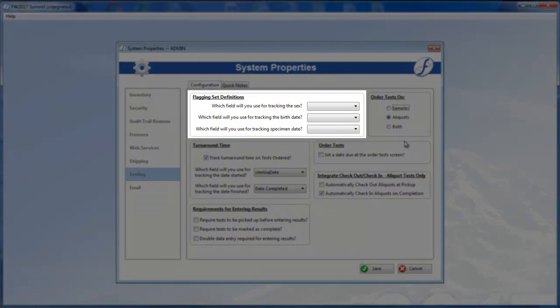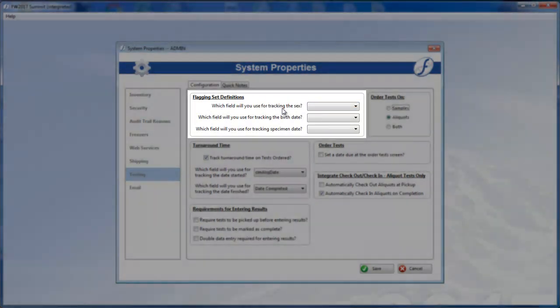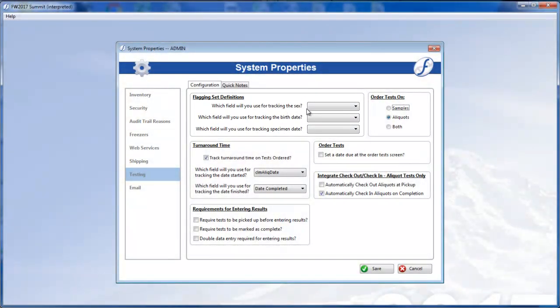Secondly, use these top three drop-downs to designate fields for your flagging sets. Flagging sets are used with quantitative results to differentiate between types of specimen.